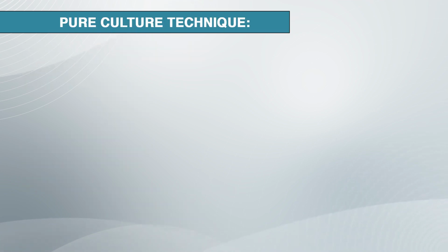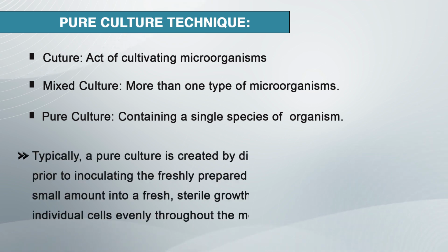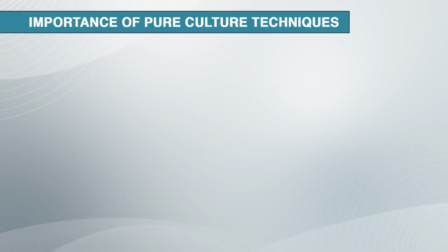Now, introduction to the pure culture technique. What is culture? Culture is the act of cultivation of microorganisms. Mixed culture contains more than one type of microorganism, and pure culture contains a single species of organism. Typically, a pure culture is created by diluting the sample several times prior to inoculating the freshly prepared medium, or by transferring a small amount into a fresh sterile growth medium and spreading the individual cells evenly throughout the medium surface.